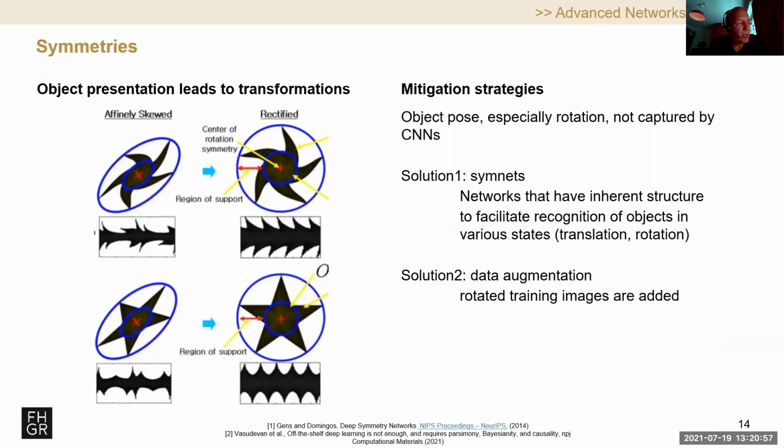So what is the problem that we come across when we deal with these approaches for microscopic image analysis? Well, one problem that I have come across also in computer vision is that it makes a difference how you present your data. If you have, let's say, a screwdriver and you put it properly with the handle on the bottom and the metal part on the top, it will be recognized. If you have it the other way around, it will not be recognized, and the like. And this is something that is annoying, I should say.